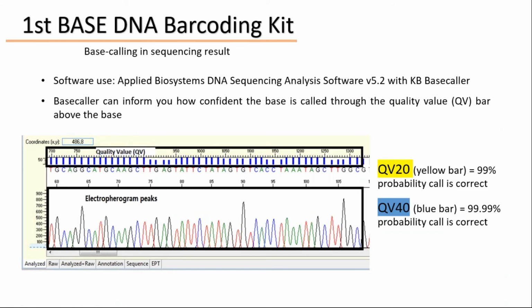You can see from this slide, whenever you get the sequencing result after the PCR, normally you will get the electropherogram that you can see from here. The quality value actually plays a very important role in the result analysis. It lets you know whether the sequence is confident or reliable to get into another step, which is the alignment or the BLAST result.